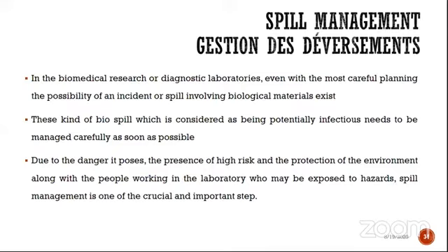And such spills not only pose a danger to a person who is working, they also present a danger for the area, and contaminate the biosafety cabinet, different types of centrifuges and equipment, even the floor. So there is a very high risk of spills while we are dealing with different types of samples, or while we are dealing with a large number of samples.